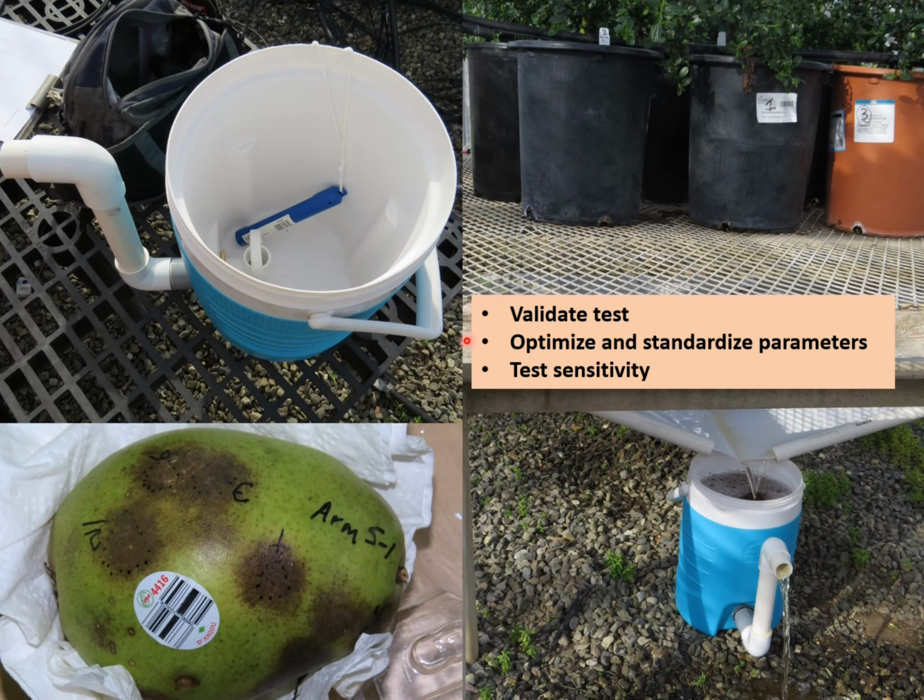But there were several other tasks. We wanted to validate this test over a variety of different types of containers and species, etc. We wanted to try to optimize and standardize the parameters of the test to make sure that we were doing it as effectively as we could. And once we do that, we still want to know what the ultimate test sensitivity is. What did positive results mean? What did negative results mean relative to how much infection might be in the plants?